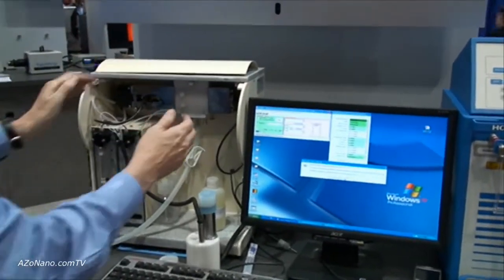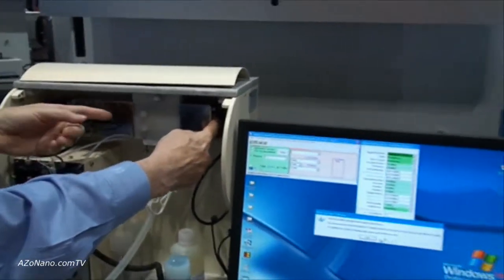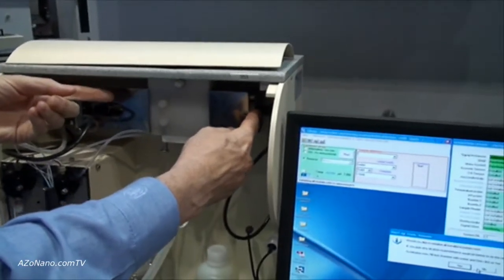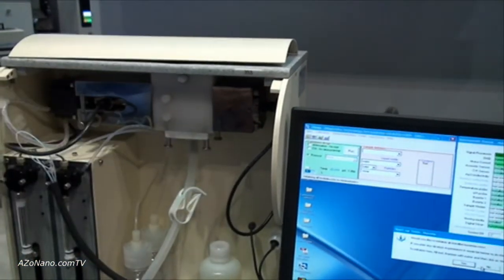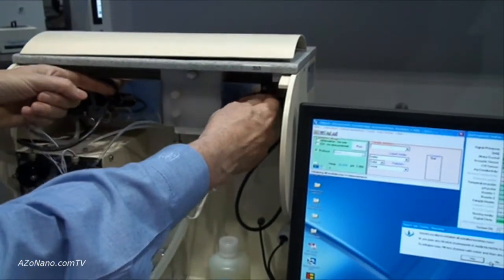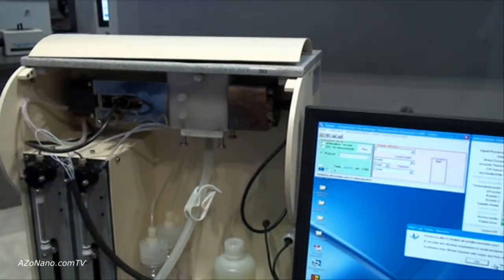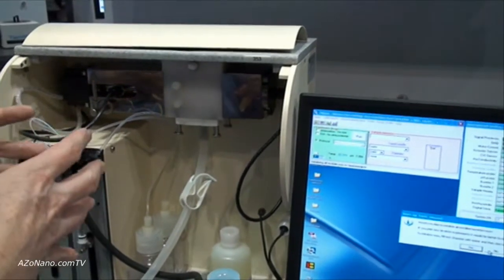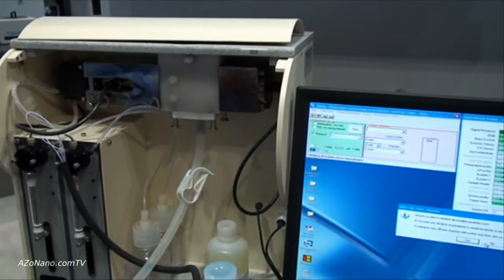It sits in this chamber and what we're going to do now is we have an acoustic source on the right and a detector on the left and we're going to measure acoustic attenuation which is the loss of energy as a function of distance between the transmitter and receiver and also as a function of frequency. We take that information and from there we can calculate the particle size distribution.